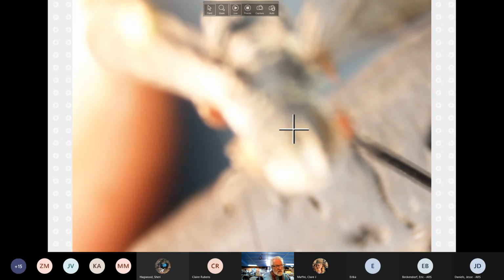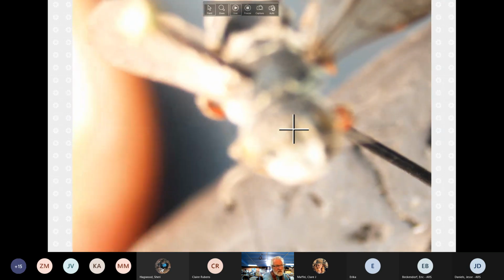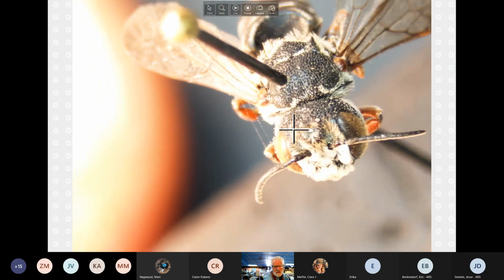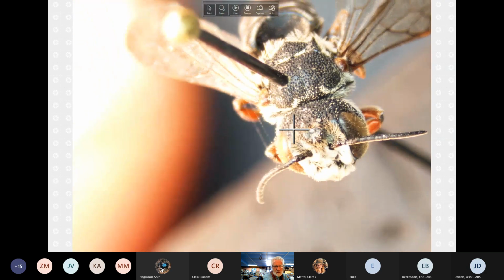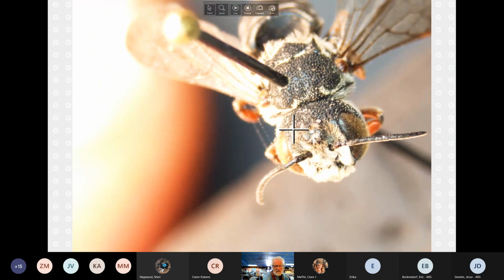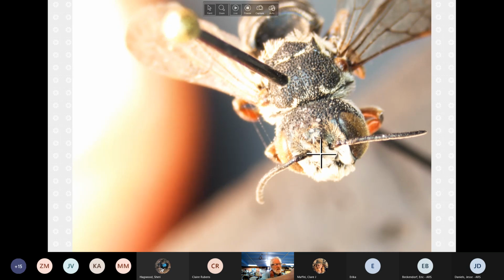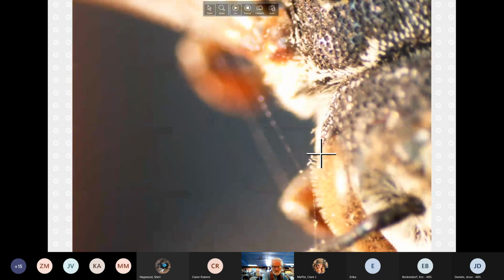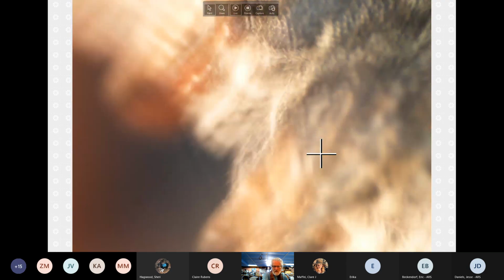This was supposed to be much clearer in presentation, and we can certainly see it better here. Here's this raised area around, and there should be a single line, not as wide a line, of pitting invading that area.